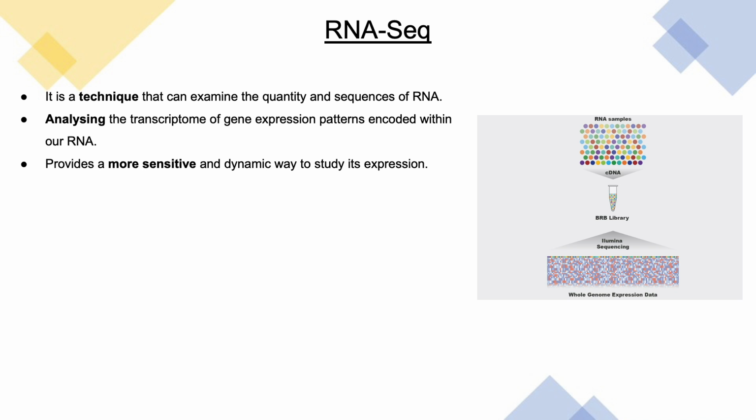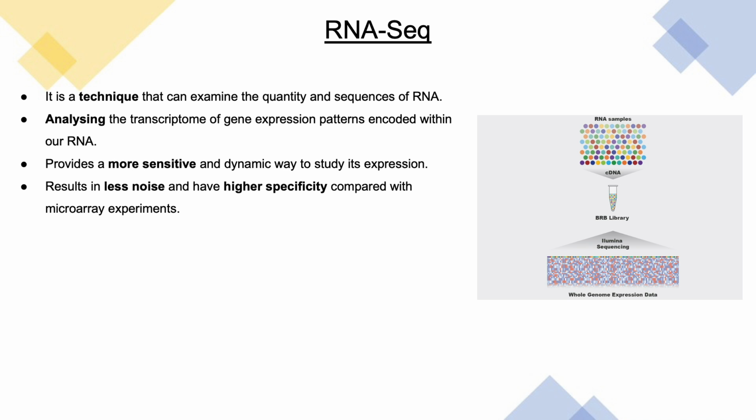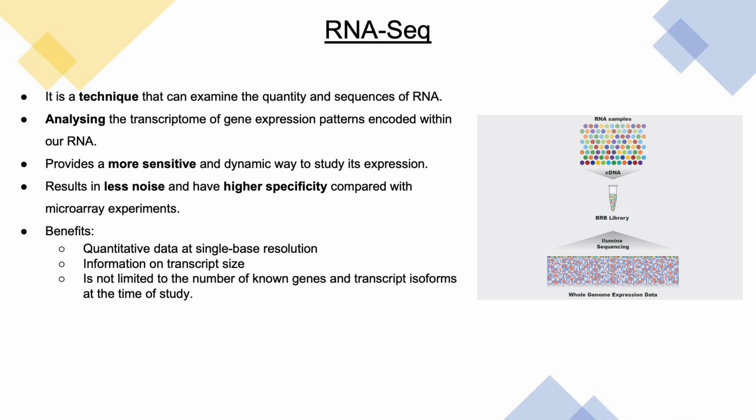This provides us with a more sensitive and dynamic way to study its expression, as the results obtained contain less noise and have higher specificity. The benefits of RNA-seq are that it provides us with quantitative data at single base resolution, information on transcript size, and it is not limited to the number of known genes and transcript isoforms at the time of study. This data can also be reanalyzed as sequence databases are updated.